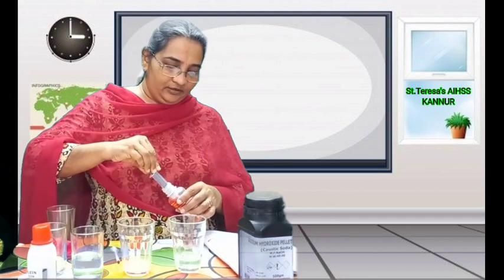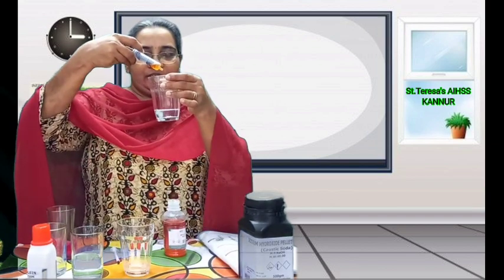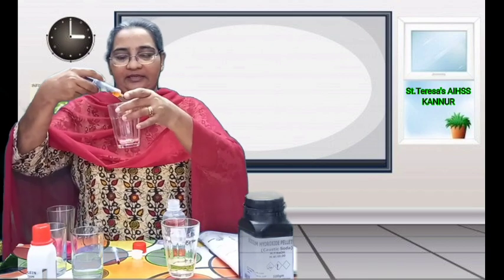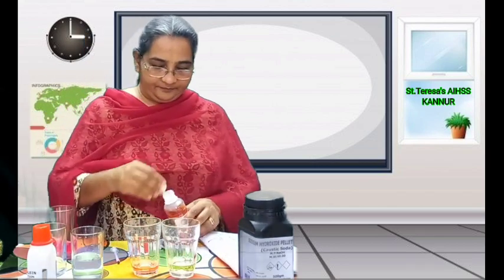So the same experiment we are going to do, using another syringe and methyl orange, and put 2 drops of methyl orange here in this alkali. Here in the acid. Now here, see what happened here.